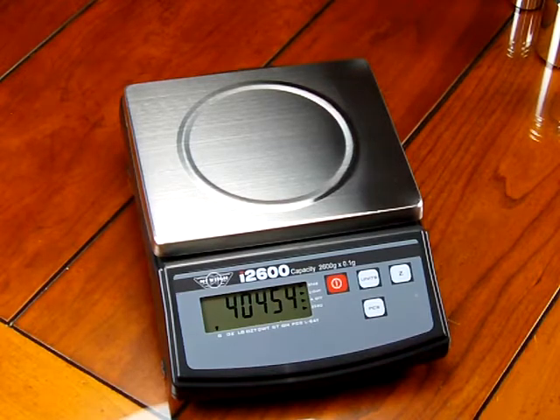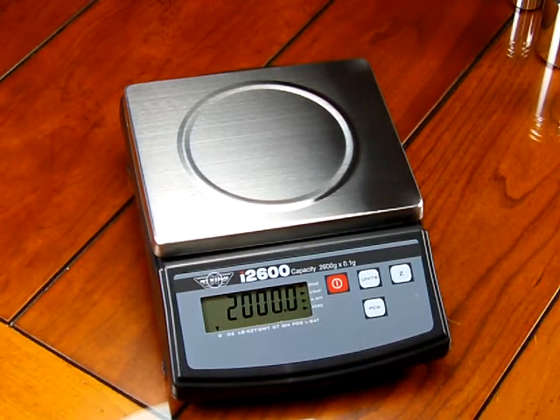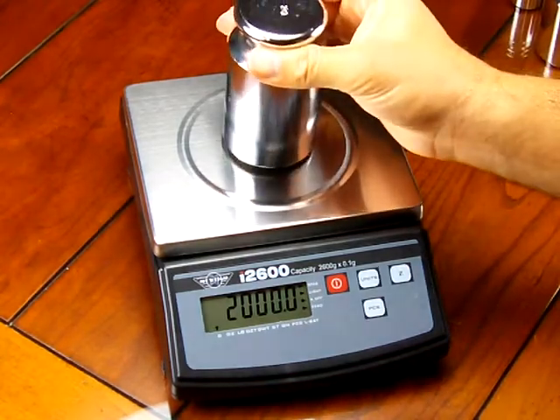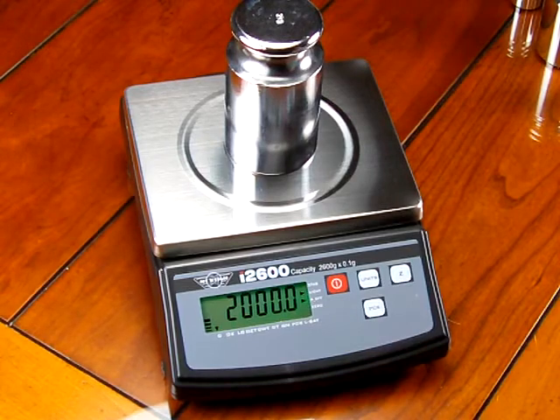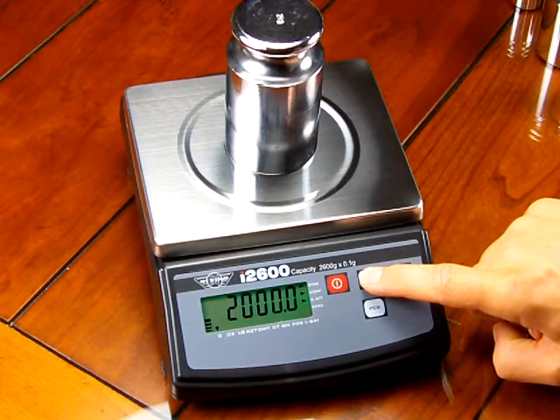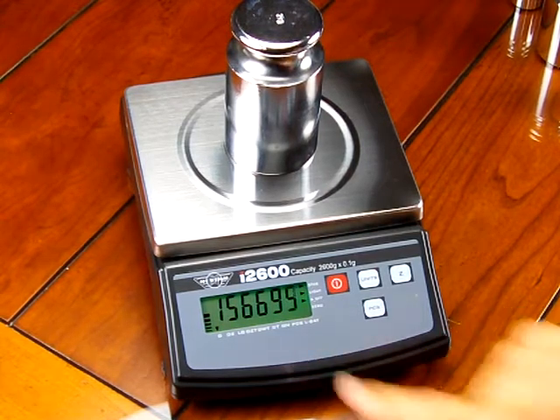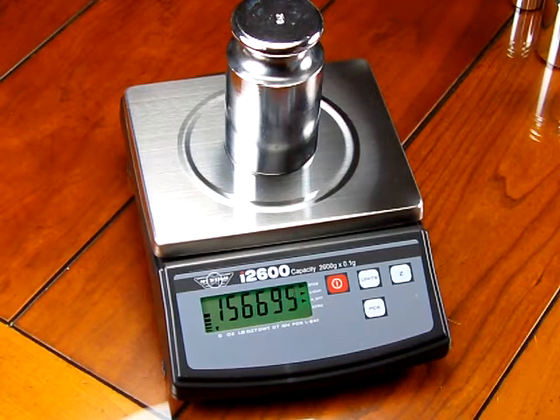Now you want to store that value. To store the value, press the units key. When you press it, you're going to see '00 save,' and then it's going to show you the calibration weight needed. When you see '00 save,' it's storing the zero reference voltage off the load cell when no load is applied to the scale. Now I have a 2000 gram weight — you have to have 2000 grams to calibrate it. Put it on the center of the platform. After you've placed it on there, just wait a moment, then press the unit key one more time. You'll see '00 save' again. It stores that value from the A-to-D converter, the digital electronics, reading off the load cell.